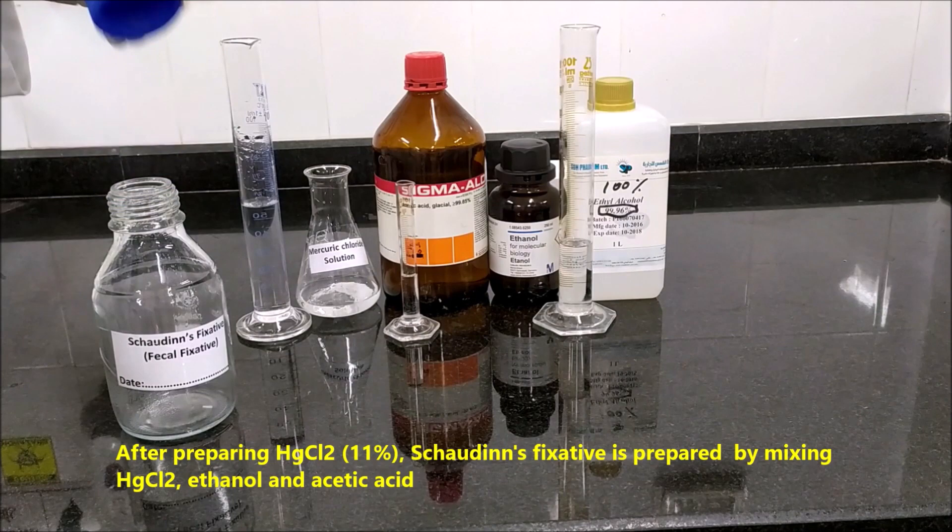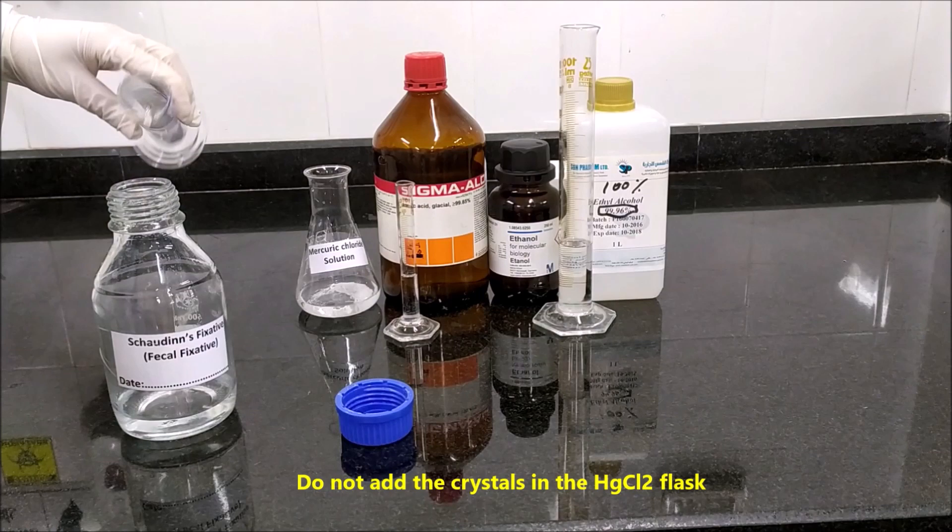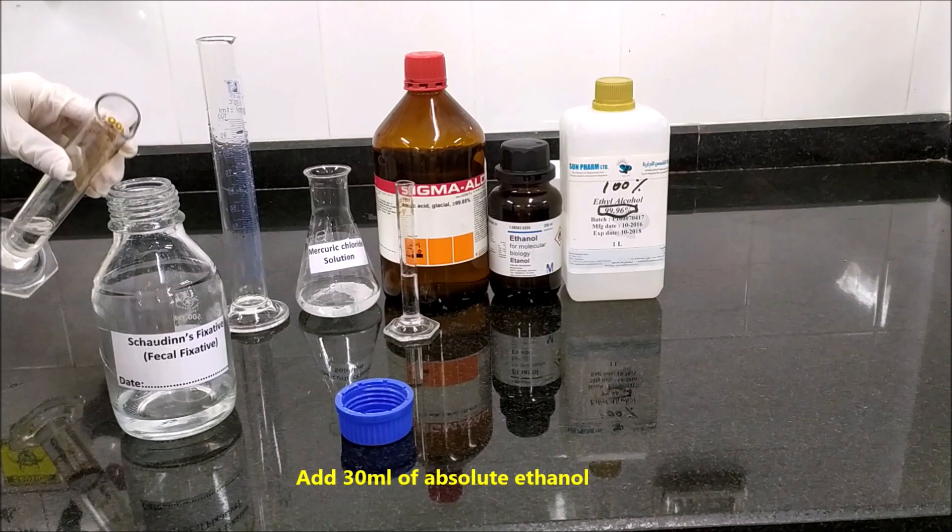After preparing HgCl2 11%, Chauden's fixative is prepared by mixing HgCl2, ethanol, and acetic acid. Add 60 ml of saturated mercury chloride 11% into a clean labeled bottle. Do not add the crystals from the HgCl2 flask. Add 30 ml of absolute ethanol.